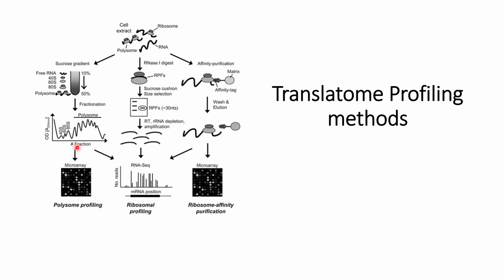Later on, a microarray assay of this polysome will help us to know which are the RNAs that are bound to the ribosome. This is based on the assumption that initiation of mRNA translation is the most critical step for the translation process. So the RNAs that are bound to the ribosome are considered as mRNAs that have already been initiated for translation.